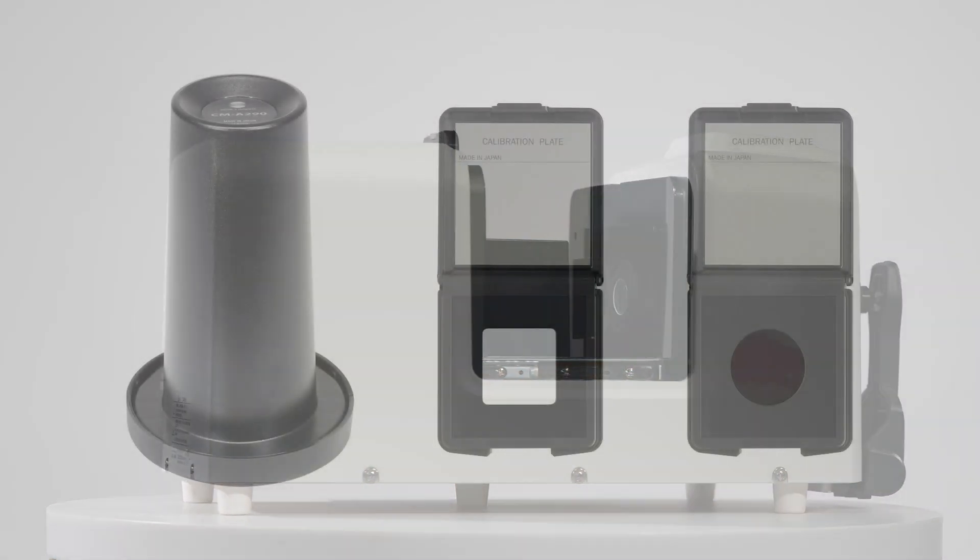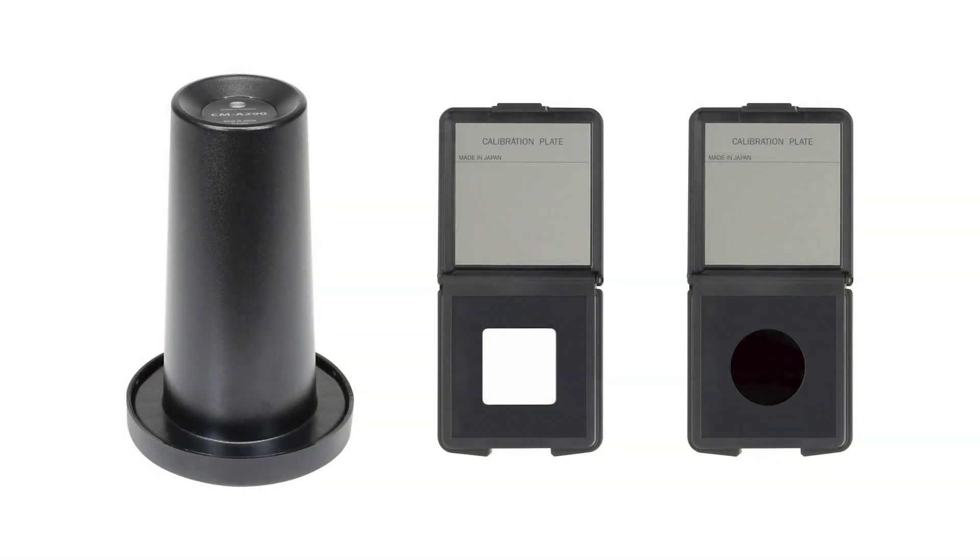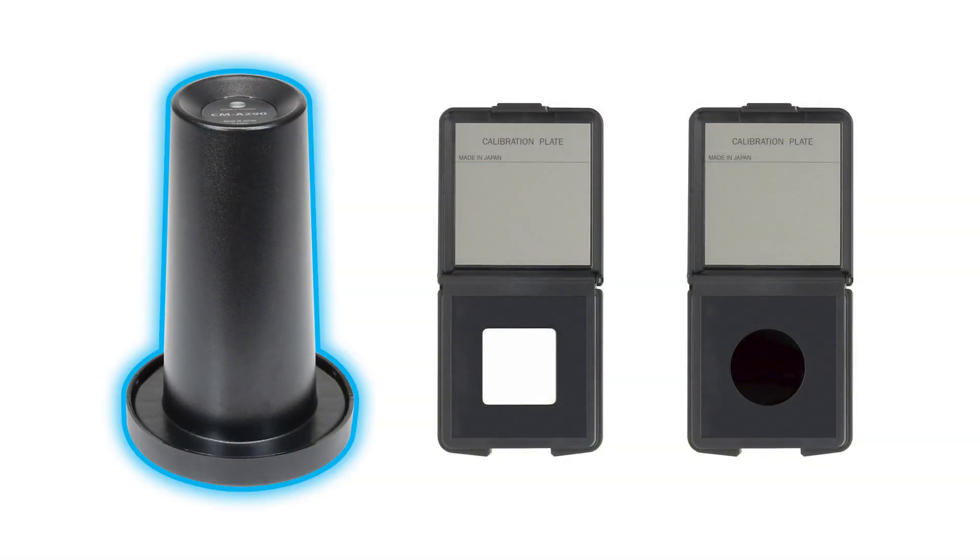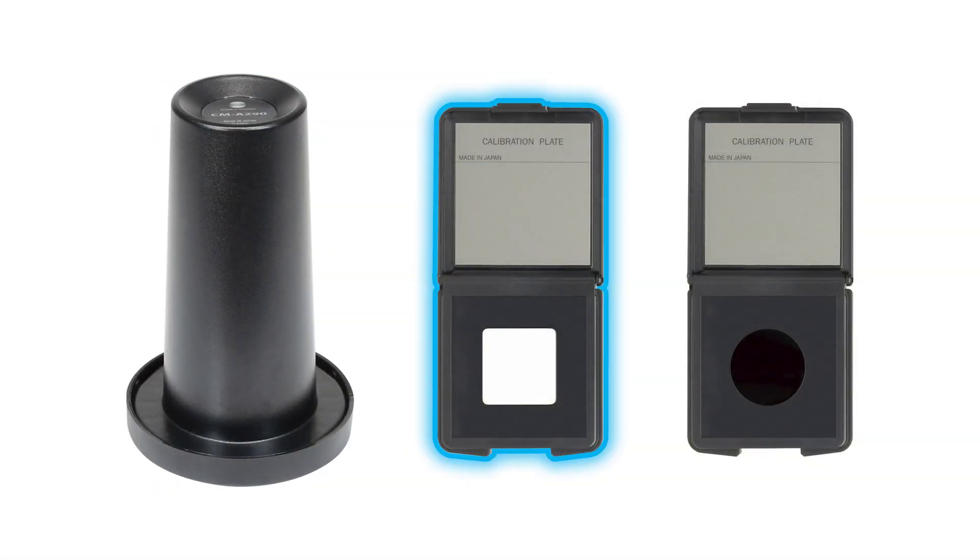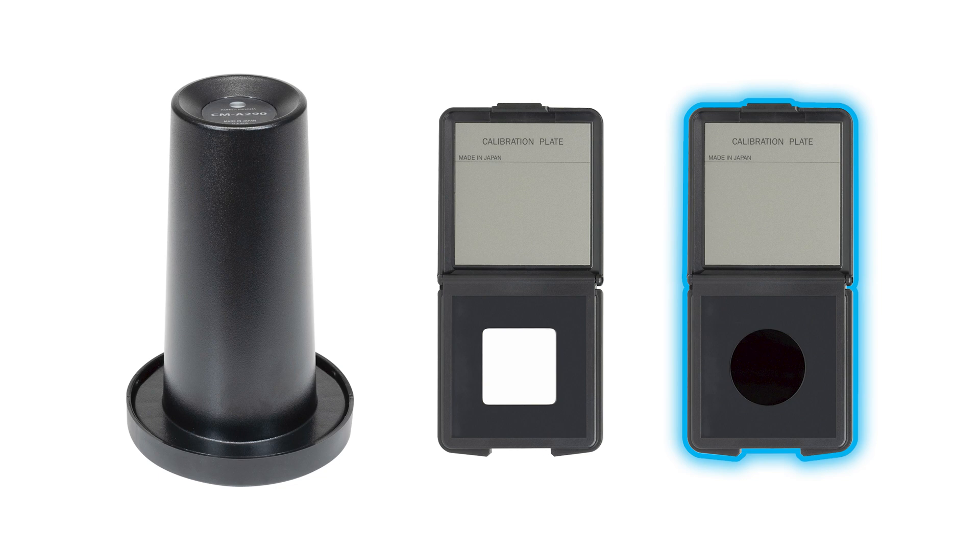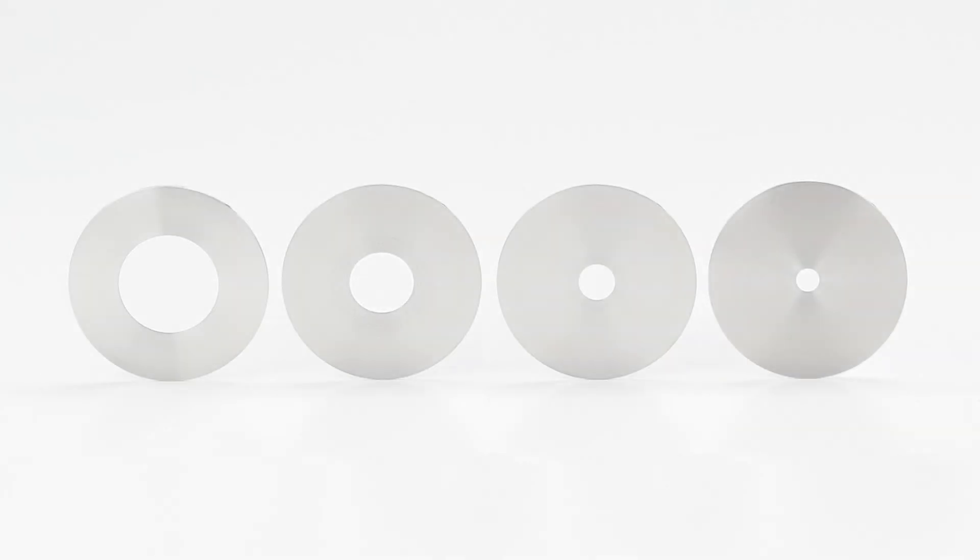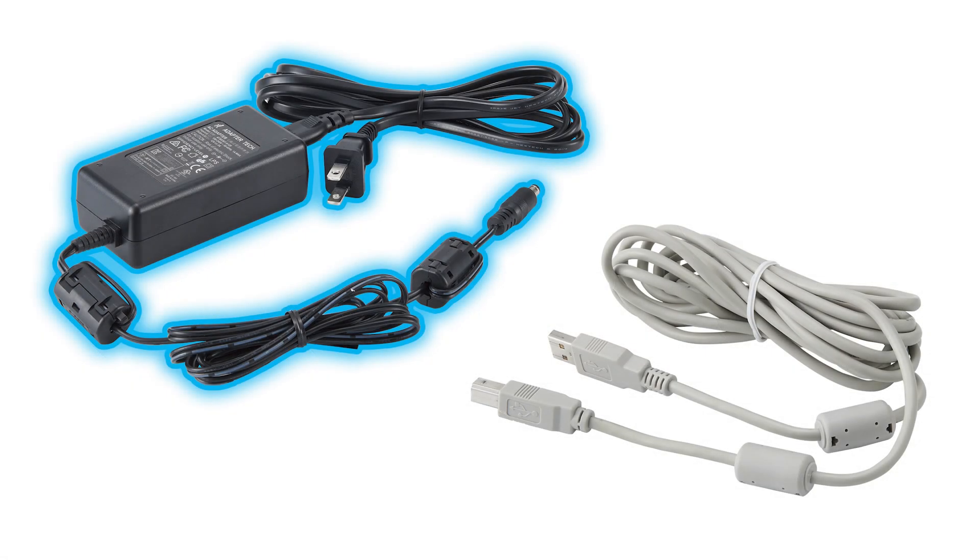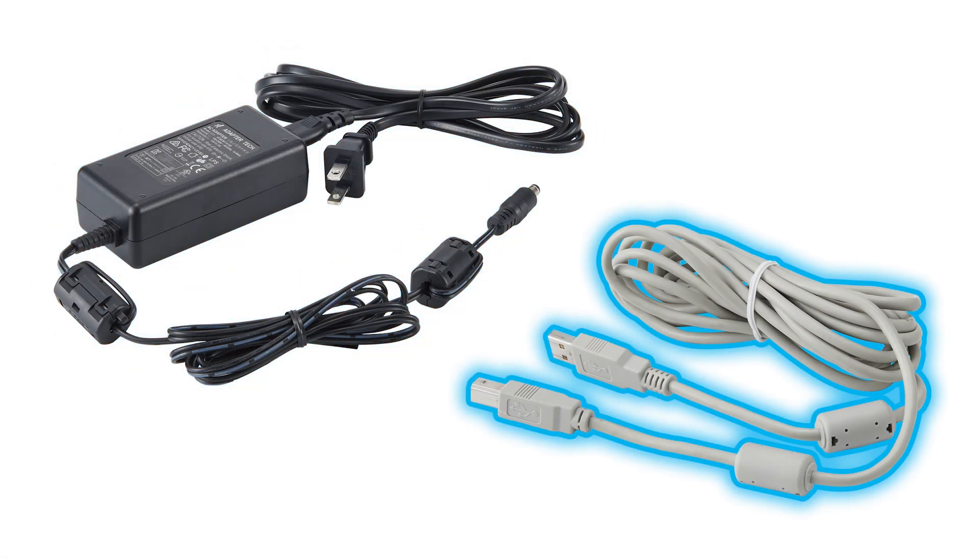The CM36DG comes with a zero-cal tube, white calibration plate and black gloss standard, four target masks, an AC adapter, and communication cable.